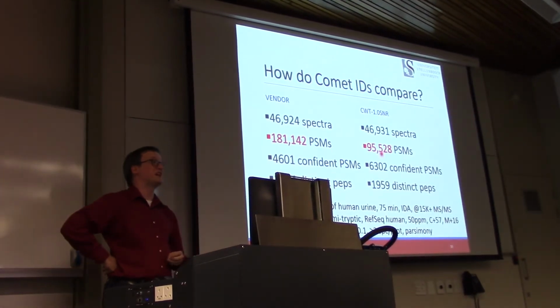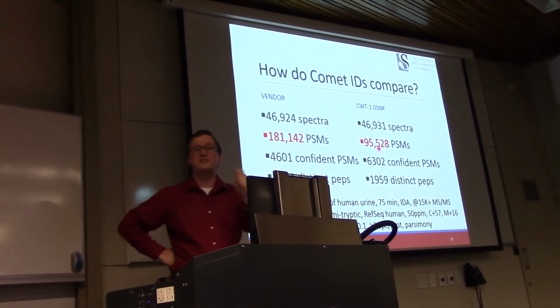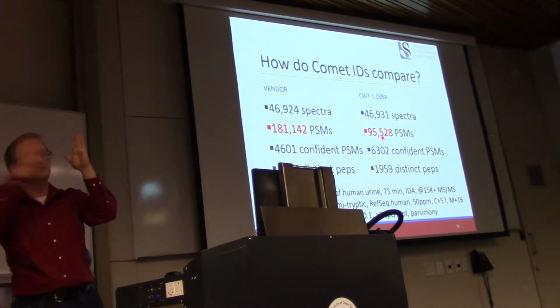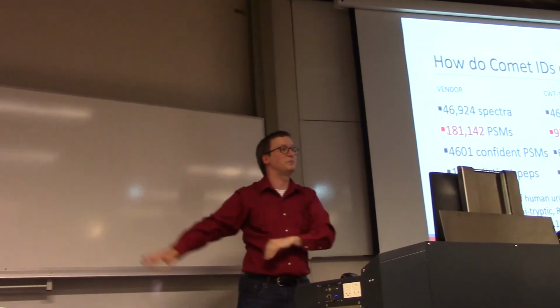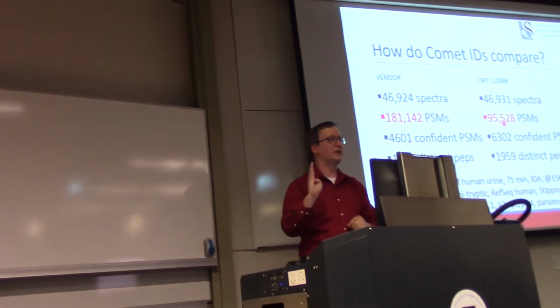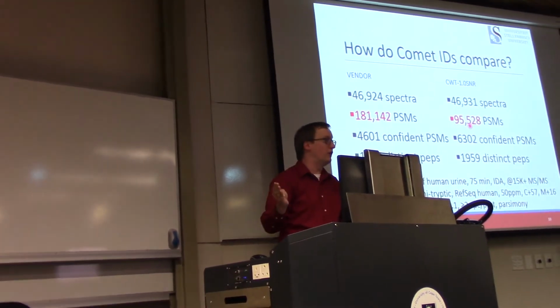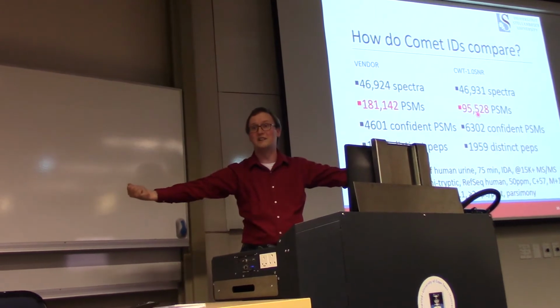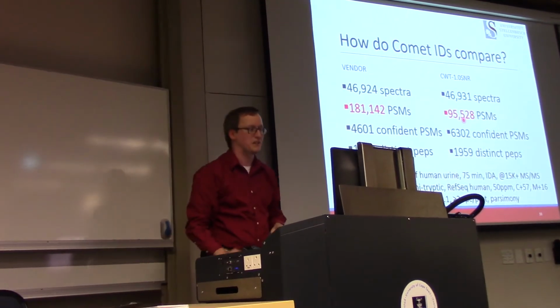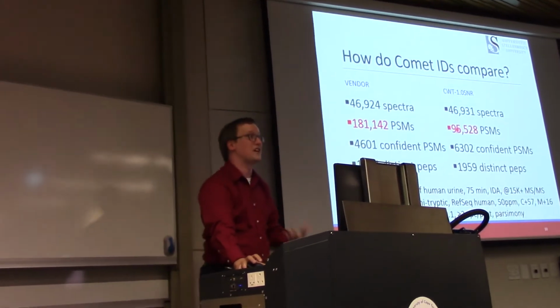I'll tell you because this pattern was set way back in the mid-1990s, and I had a lot of conversations with the author, Jimmy Yang. What happens is that the software tries to determine, is this spectrum singly charged? But in doing so, it just asks, are all the fragments below the precursor M over Z? If it is, it treats it as a +1, and that's the end of the story. If it has fragments on either side of the precursor, though, it says, gosh, this thing is multiply charged. Maybe it's +2, maybe it's +3, I don't know. And so it'll try to identify it both ways. So you get two different assessments of what this spectrum represents, one under the +2 assumption, one under the +3 assumption. That takes time. So having precursor charges is valuable to you when you do your downstream analysis.